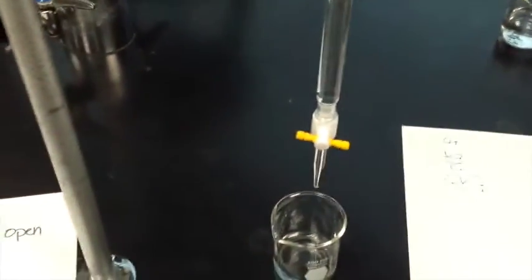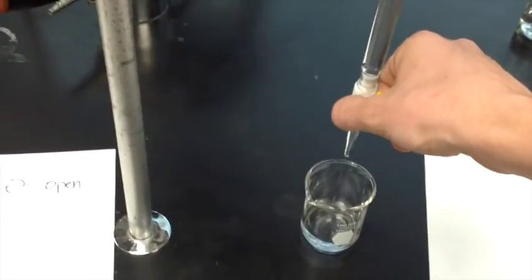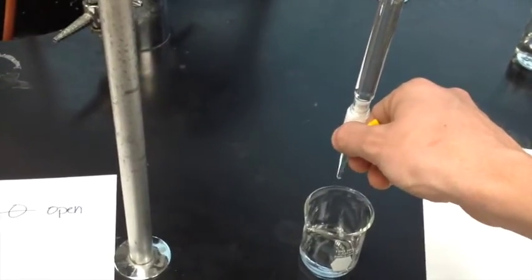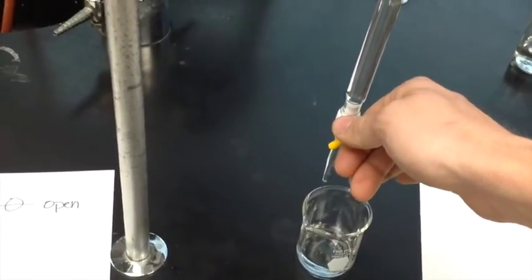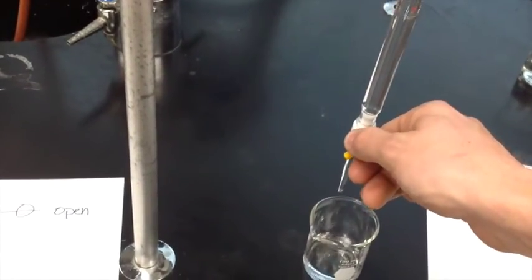Without going through exactly what's going to happen yet, we need to do a little bit more work with the lesson first. You would flow some water or some base or whatever your titrant is from up here into the titration. Turn the stopcock on. What you don't want to do is just have a jet of water come out. That's not useful. You want this to be open just enough. Close it back, to just drop-wise.